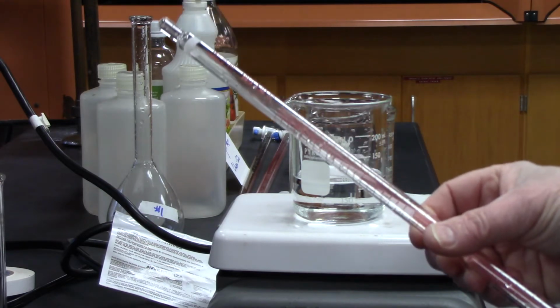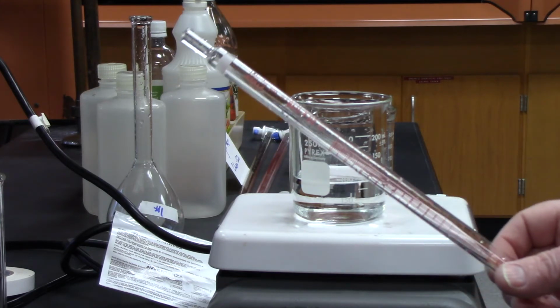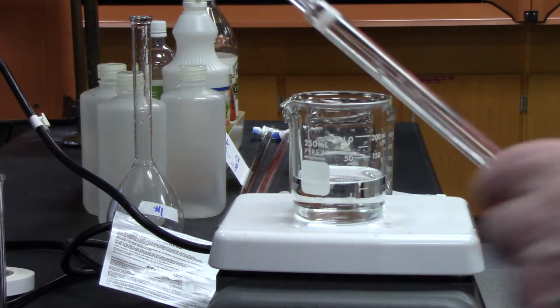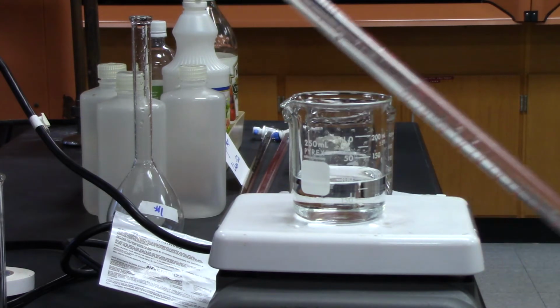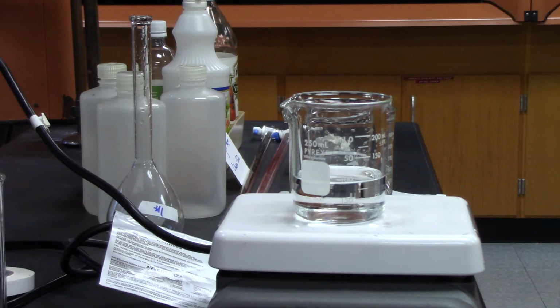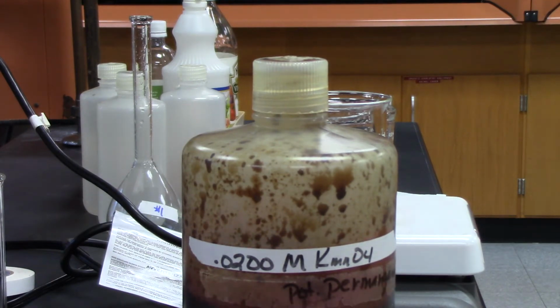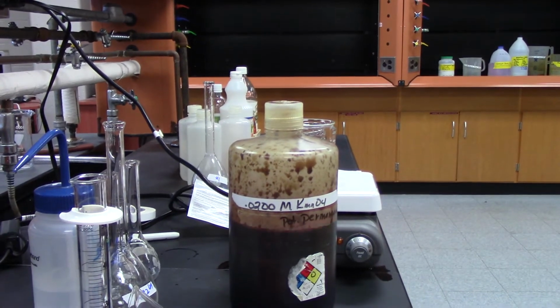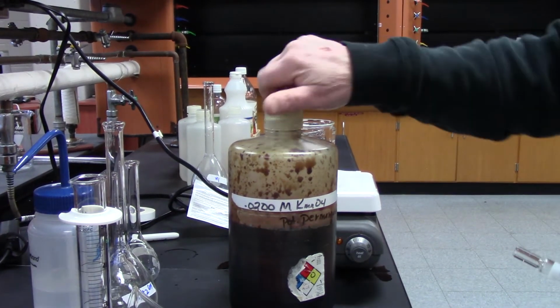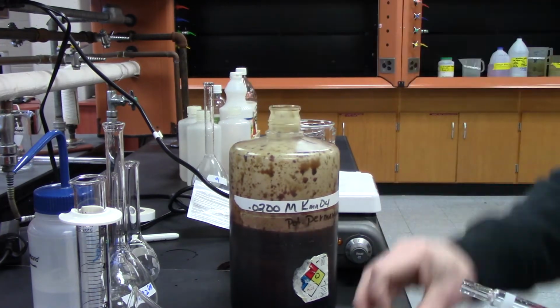this is a pipette. It's like a big eyedropper. And this guy is 25 mils. And it has marks to the 10th. That actually means we can measure it to the 100th. Okay, so I'm going to, from my solution here, my stock, I am going to take out 25 mils and then put it in my beaker.